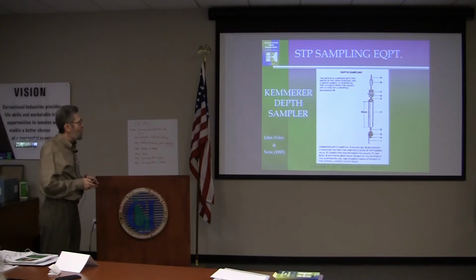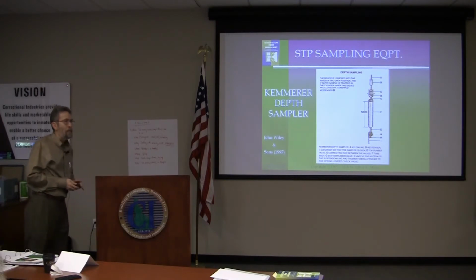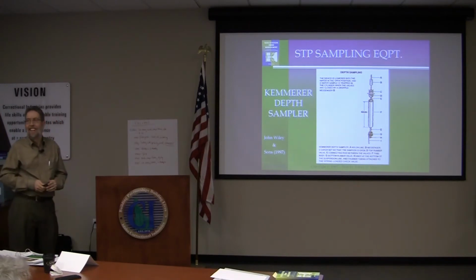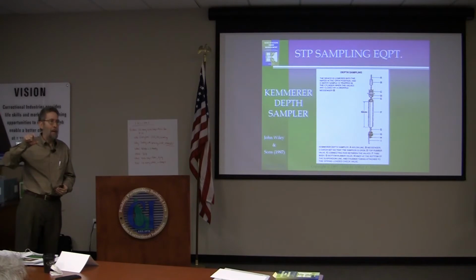They now have something which is really even better, I think. It's only been out a few years. It's called the Aloha Sampler. Guess where it was developed? Hawaii. Yeah. It's really cool. It's just a little jar kind of thing, plastic, about this big. It's got 2 holes in the cap.